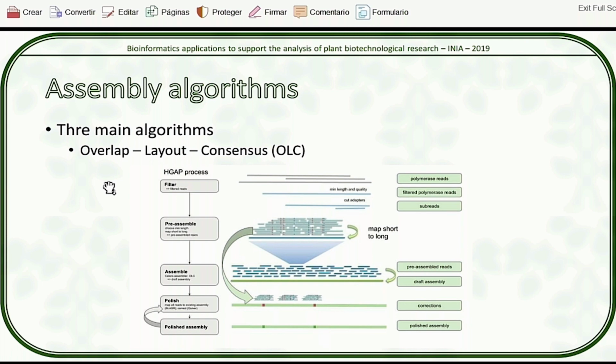after doing very deep sequencing, only like 20x coverage of the longest sequences. You use the smaller sequences to align to those larger sequences, which are going to be the seeds, and to polish them. By polishing them, you are increasing the quality of those seeds. And by increasing the quality or the accuracy of those reads, you are able to find better alignments between them. And you're not using as many reads as you would in Illumina. So the overlap step is not going to take as long. You also have a lot more sequencing to find better alignments. So the overlap stage is not going to take long.